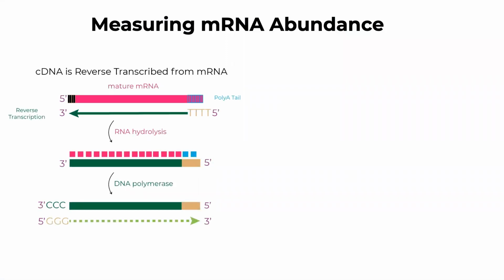For example, when we talk about reverse transcription PCR or RT-PCR, what it does is it amplifies DNA based on two primer sequences framing a section of interest. And since PCR amplifies DNA, not RNA, RNA is first converted back to DNA prior to amplification. This is done via a process called reverse transcription. So that's where RT-PCR comes from. In nature, this is a process that is carried out by retroviruses.